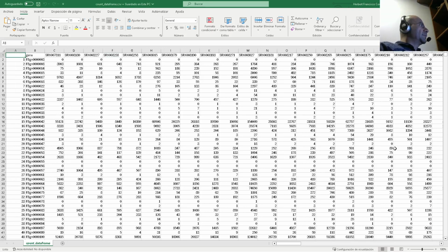This is the dataset for the flies. Once we have our data in hand, the next crucial step is data processing. Let's break it down into a series of actionable steps and roll up our sleeves. Start by loading the count data and transforming it into a matrix.